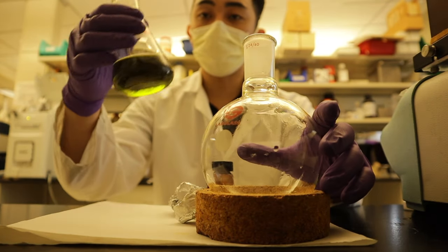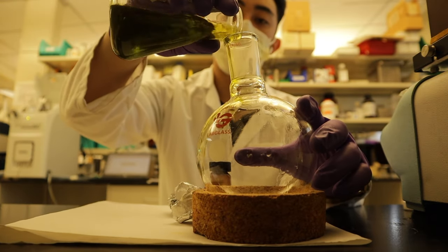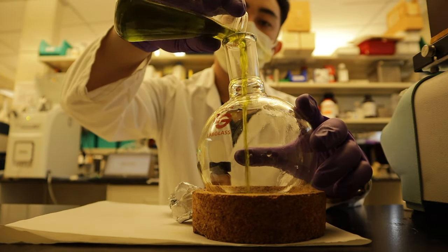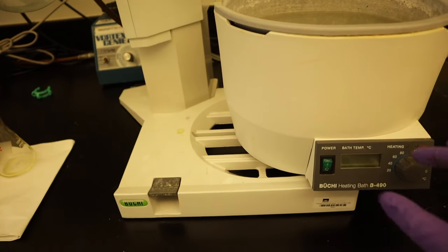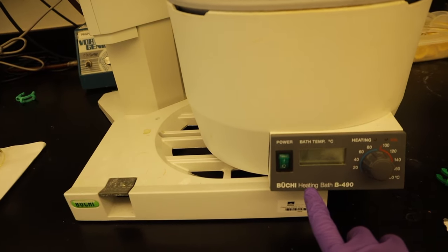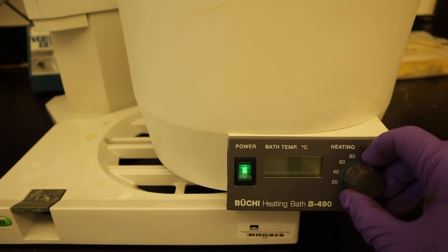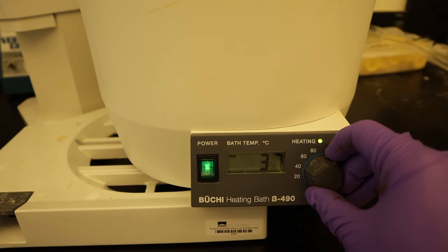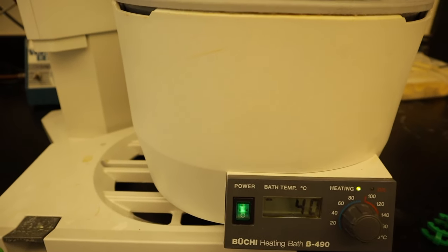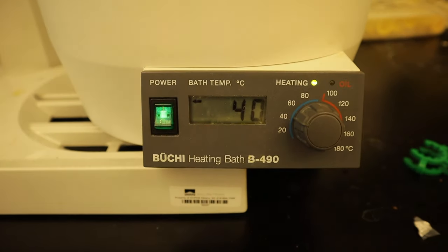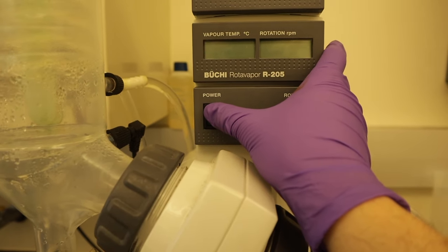First, we'll be transferring this solution in this round flask. The next step is to turn on the heating bath. Set it at about 40 degrees. And then turn on the rotary evaporator.